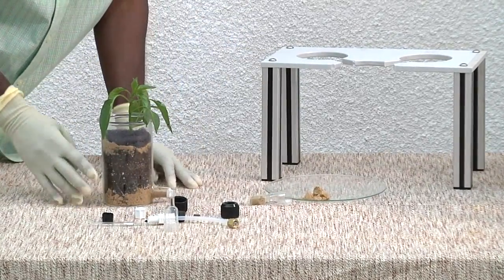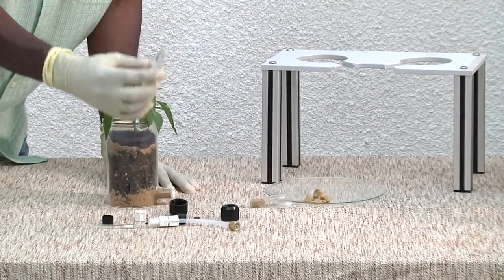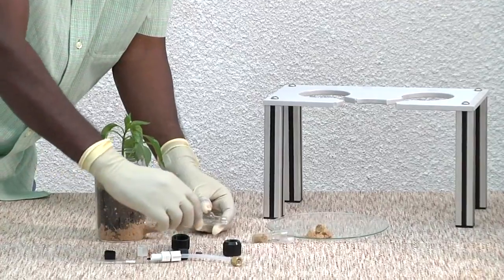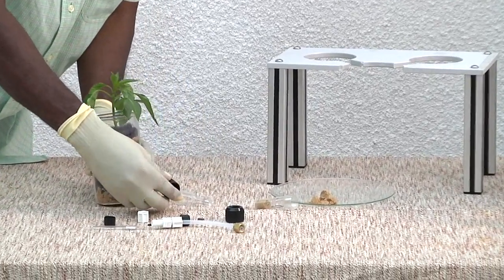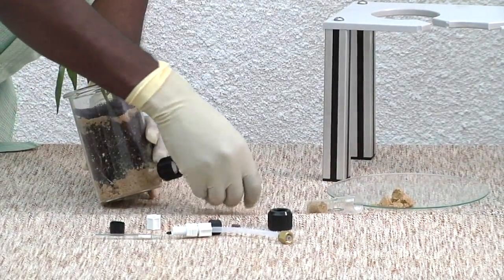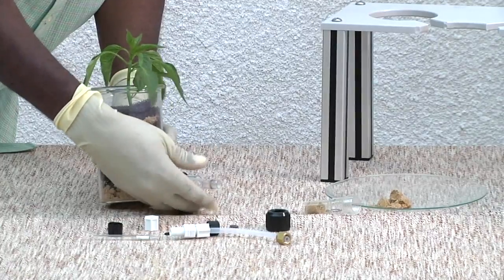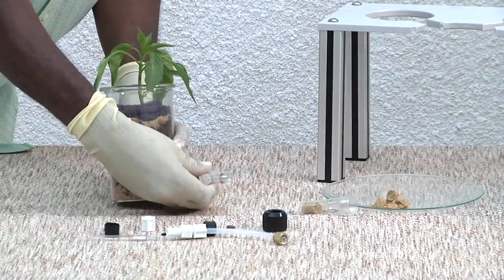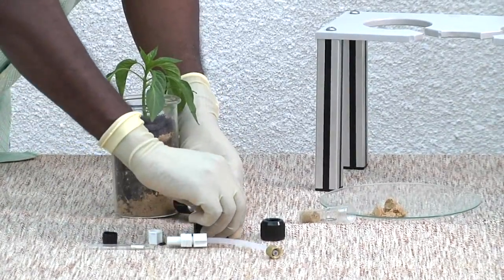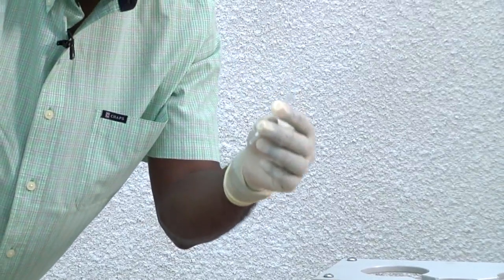Now you may choose after the assay to collect volatiles, which means that you would need a special adapter for it. This is the adapter, which you attach to the plant growth chamber. The way to do it is: attach the black cup, then the O-ring, and then screw this up onto the black cup. The next step is to attach the screw cup, but before then, what you do is attach your volatile collection trap.